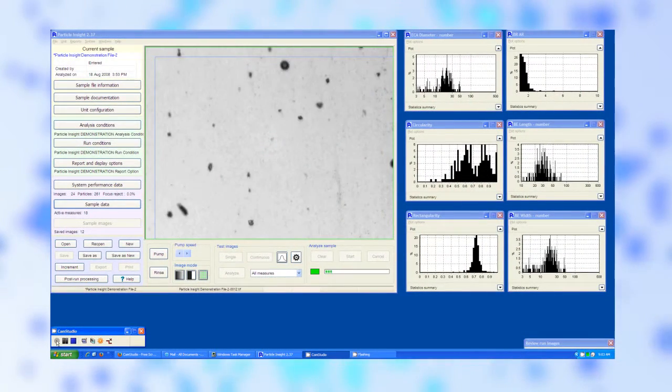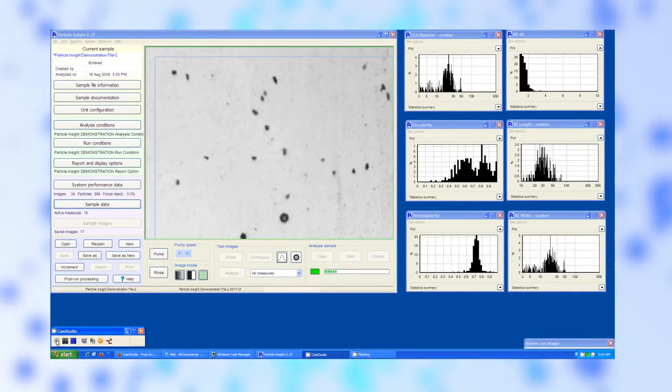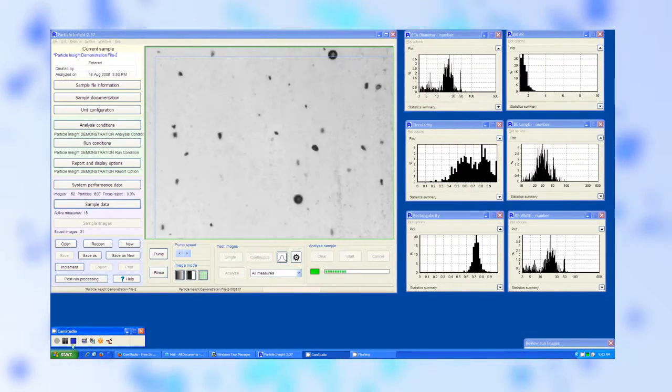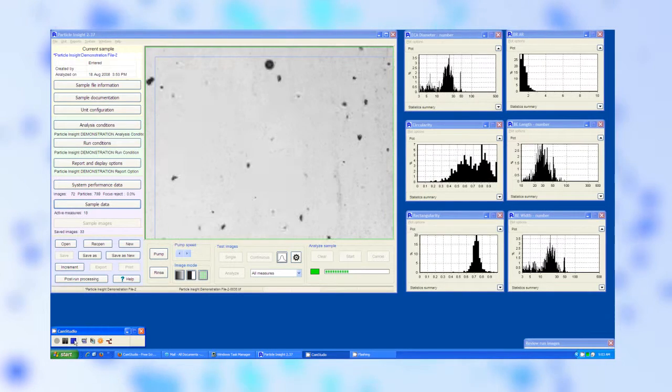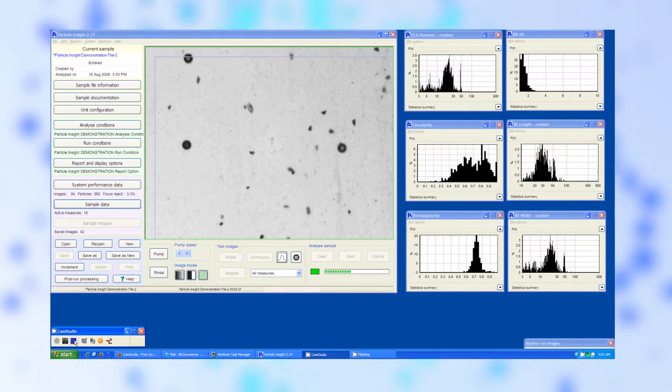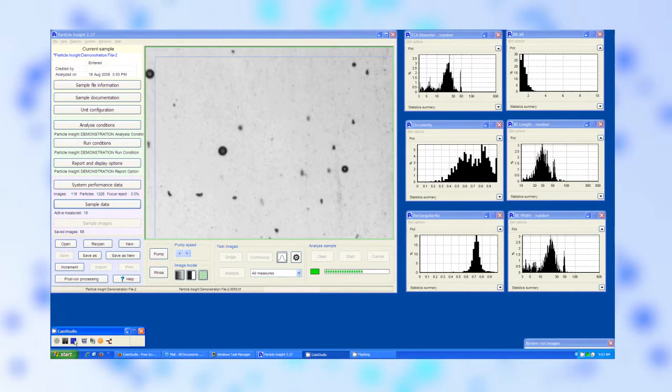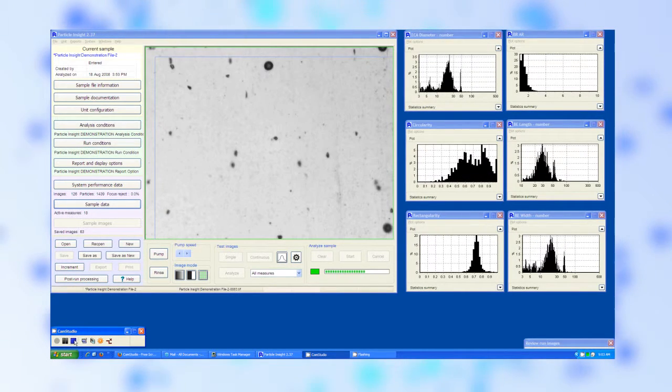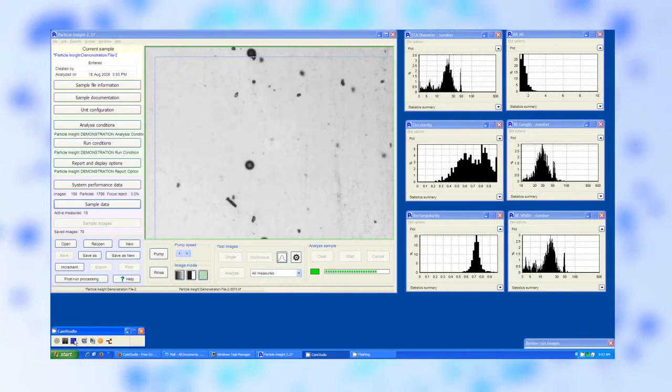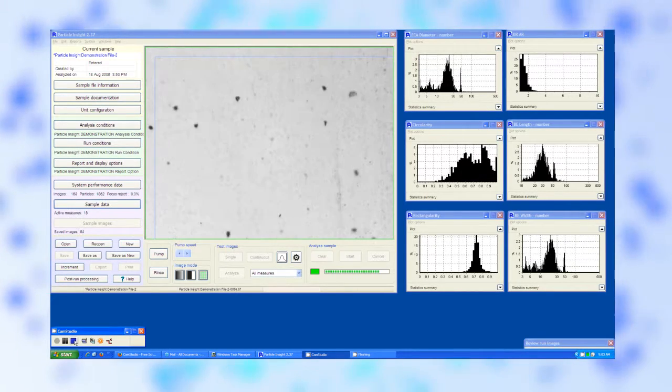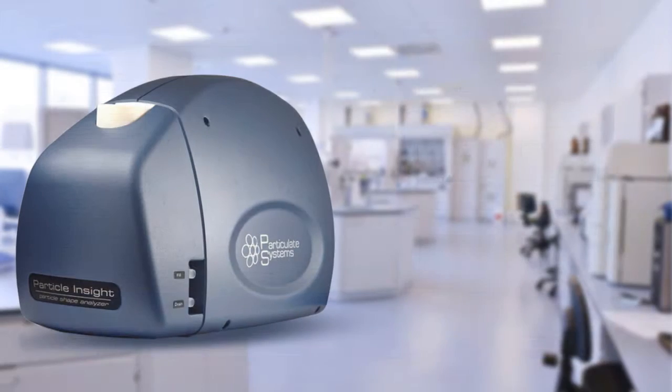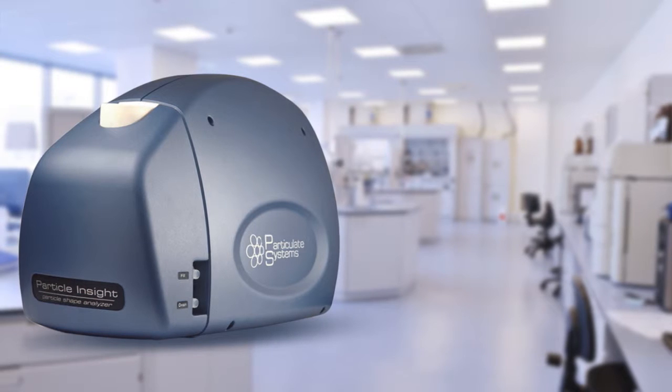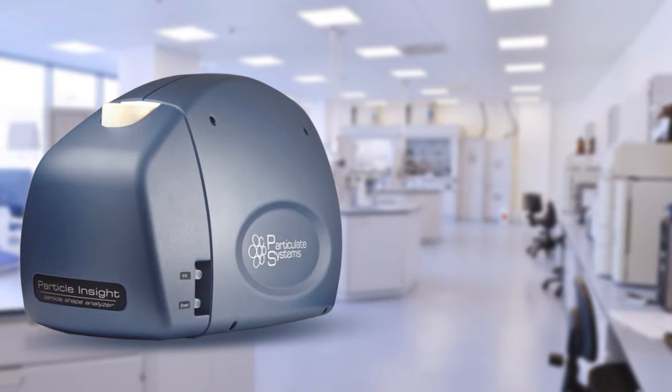Those images are then processed by highly specialized software that applies a vast library of factors to determine dimensions of the material and calculate size distributions based on those shape definitions. The Particle Insight uses a high definition camera to capture particle images and advanced software with 30 shape factors.